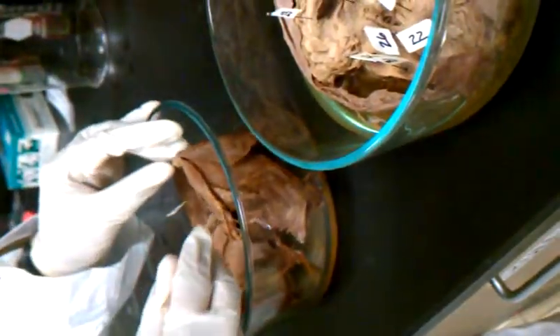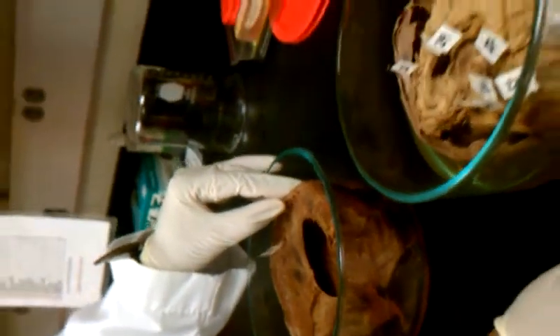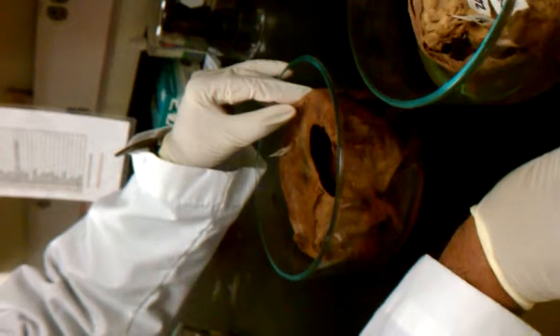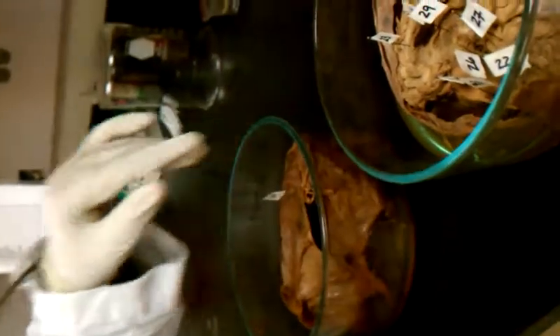Okay. And this is your dura mater. But the dura mater, when it comes in the middle, in the longitudinal fissure, the number 50, we call it falx cerebri. Okay. So if it's here, dura mater, if it's here, falx cerebri. Okay. On the sheep brain, we cannot do the falx cerebri. We just put the pin through the membrane for the dura mater.